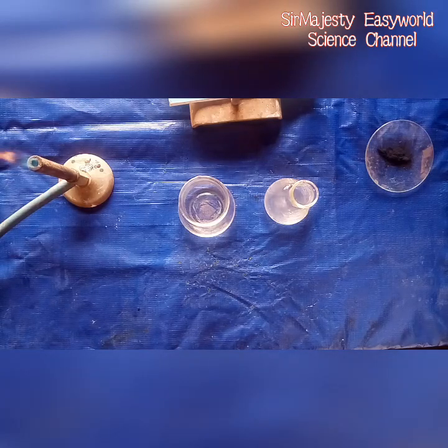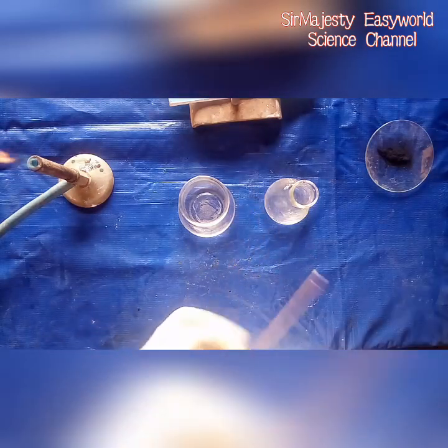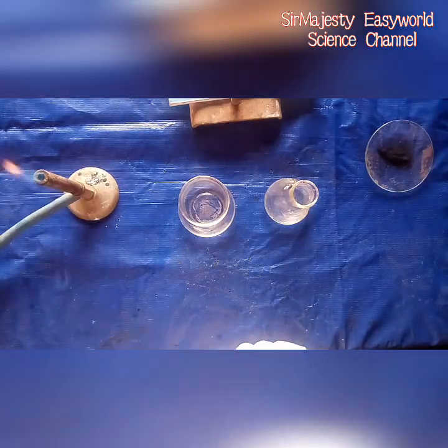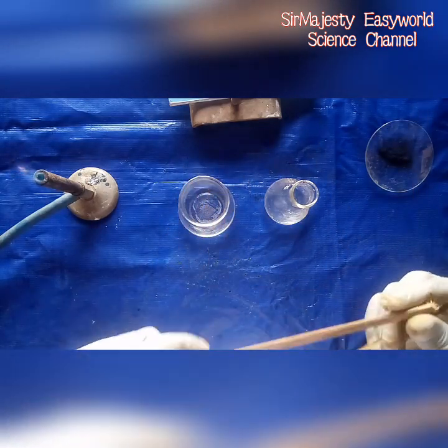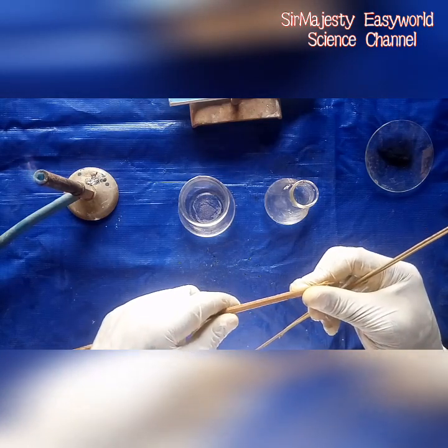We have what we are going to use as a splint. Our Bunsen burner is on already, as you can see the flame there. You can also use this as a bigger lighter splint.